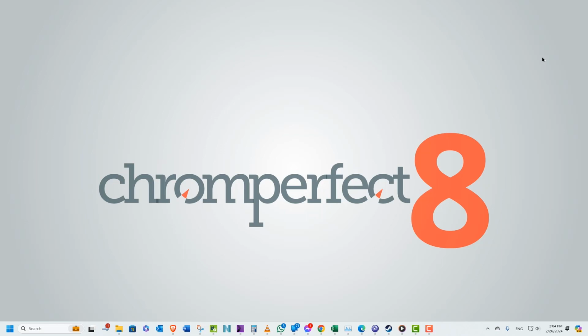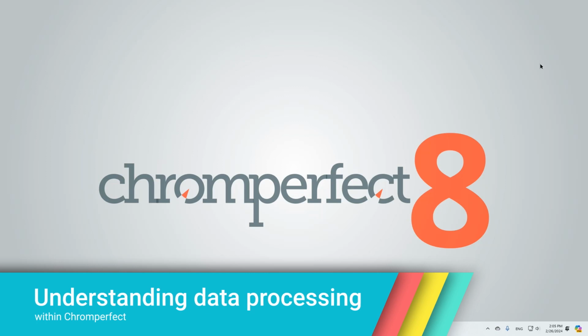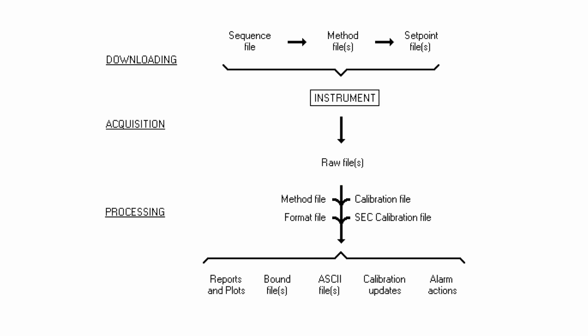So, in this video we are going to have a very quick look at the structural operation of a Chromperfect system and the key components which may contribute to these calculated results and final reports. The diagram on screen shows the flow of data and control during the downloading, acquisition, and processing steps. Every data file which is acquired with Chromperfect requires a method file, and although there may be additional sequence and setpoint files, we're going to ignore these for the purposes of this explanation.